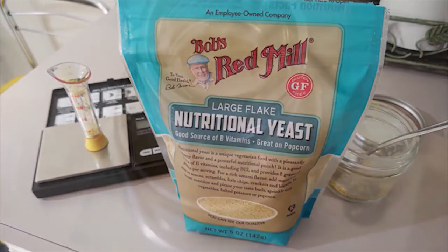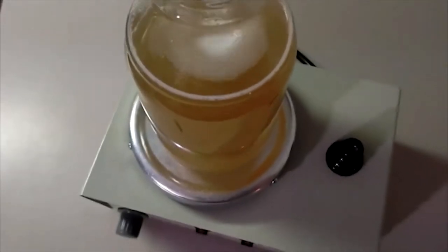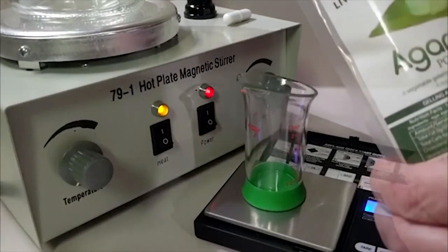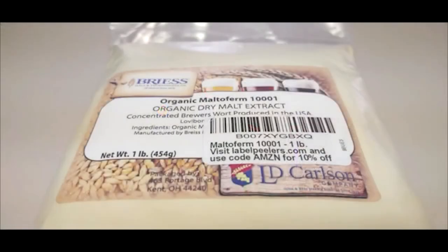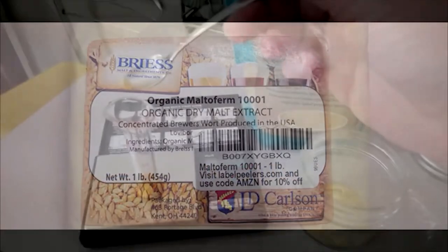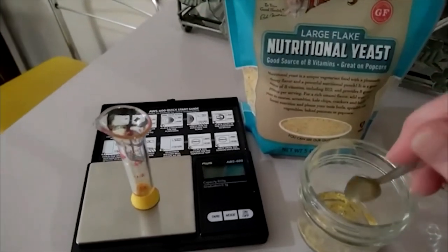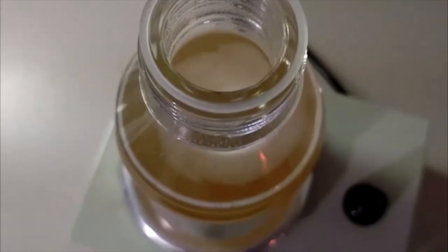We experimented with many different recipes and we really feel like we've perfected this one. So when creating 500 milliliters of agar, you want to use 10 grams of agar, 7.5 grams of malt extract, 0.25 grams of nutritional yeast. Yes, that's 0.25 grams of the nutritional yeast, again, to create 500 milliliters.